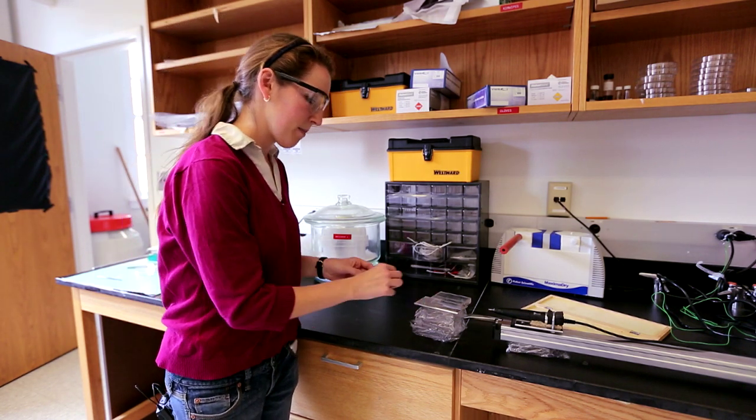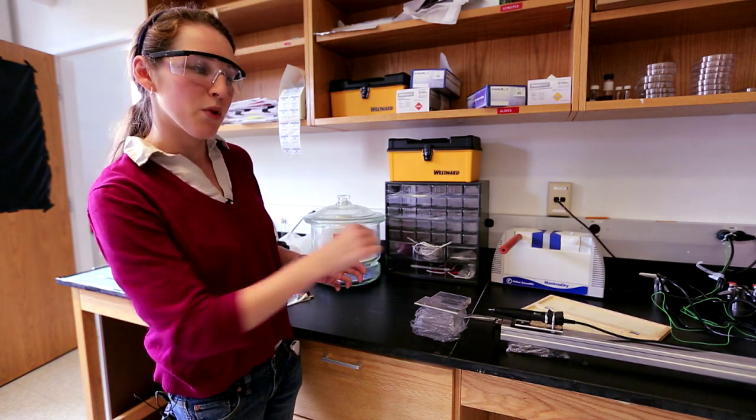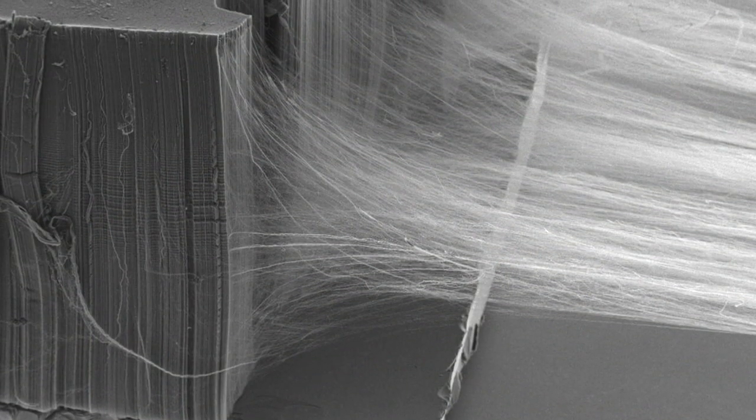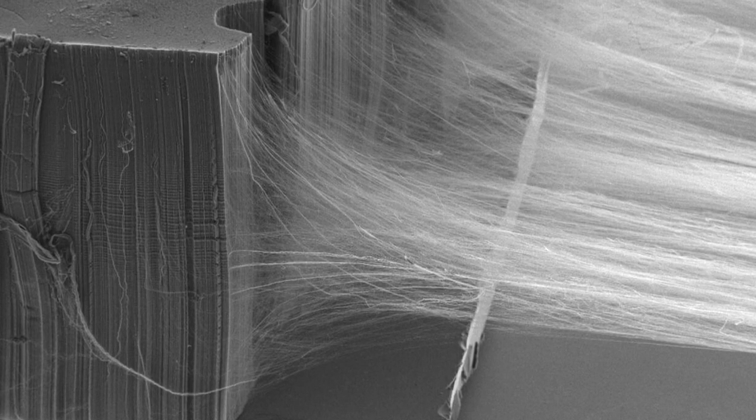When we actually pull on the tip of one of these carbon nanotube bundles, we can pull out a web. And it almost looks like a spider web. And as we twist that web, we can spin it, much like you would spin yarn or something.